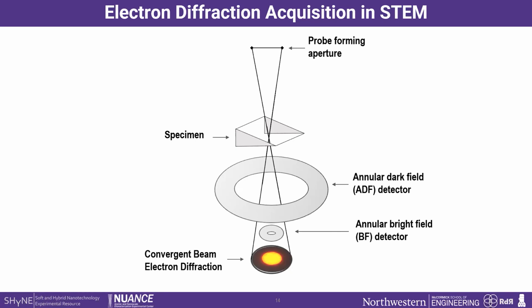Not only leave your microscope session with an image here, but also collecting a diffraction pattern. And I'll say over like five years ago, a little bit more, the introduction of direct electron detectors really helped on that. These high-speed pixelated direct detectors help you to collect that at the same time that you collect your image, especially because they can match the speed of your imaging collection in STEM mode.